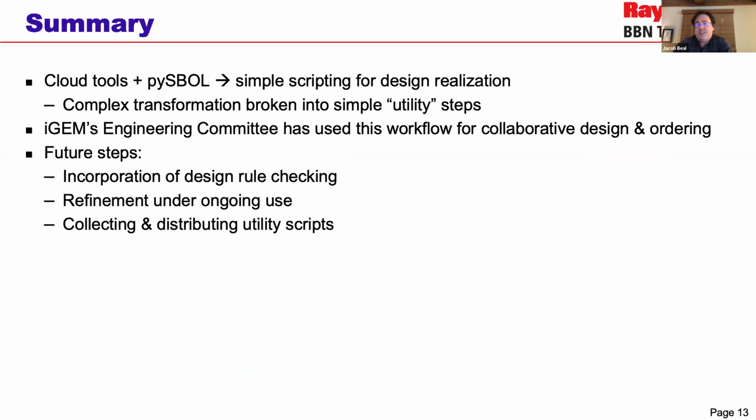using simple cloud editing tools plus the PySBOL library, in particular PySBOL 3, let us do some really simple scripting for realizing our designs out of the whiteboard-level sketches that are much more intuitive for us to have discussions at. It's a complex transformation, but it was able to be broken down into several very simple utility steps that are likely reusable in other workflows as well. We have been using this workflow for collaborative design and ordering. The first interlab is running right now.